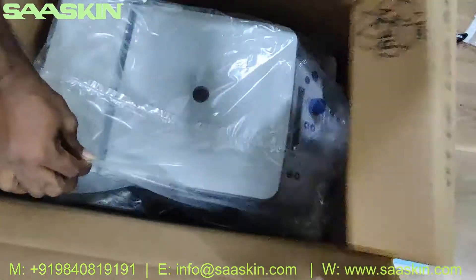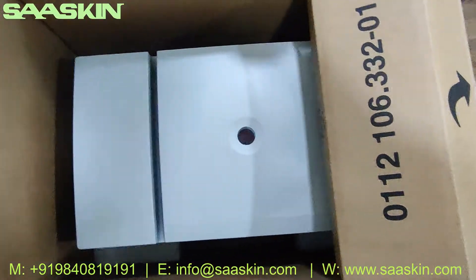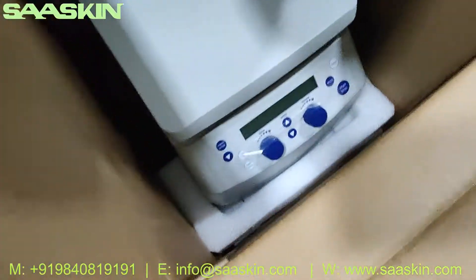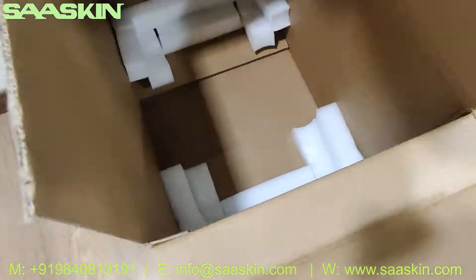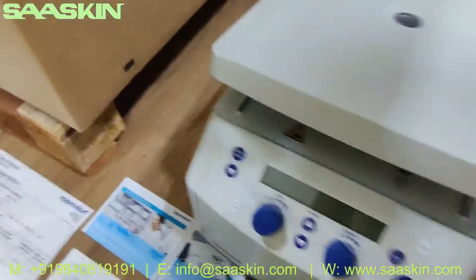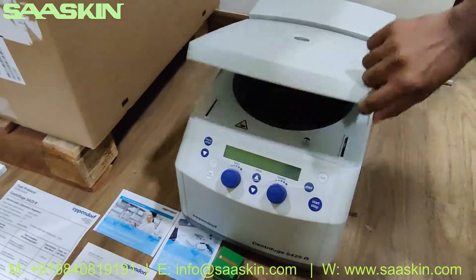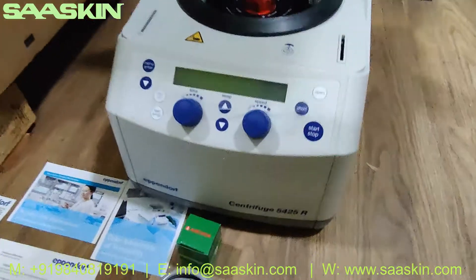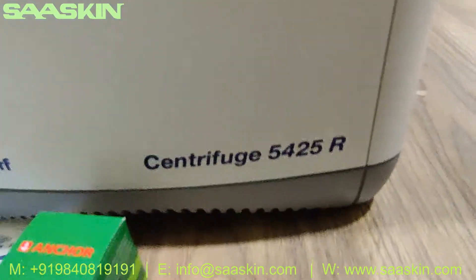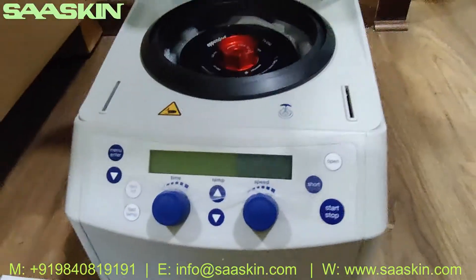I'm going to load the machine. This is how the machine looks like. Here's the machine — this is the Eppendorf centrifuge 5425R model.